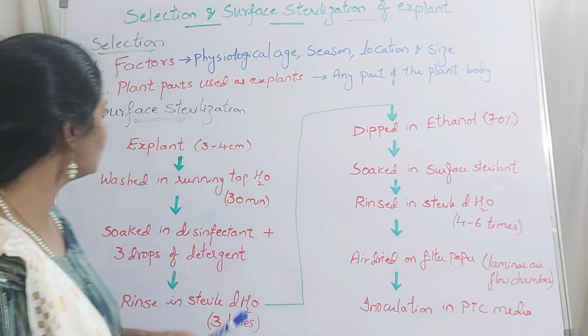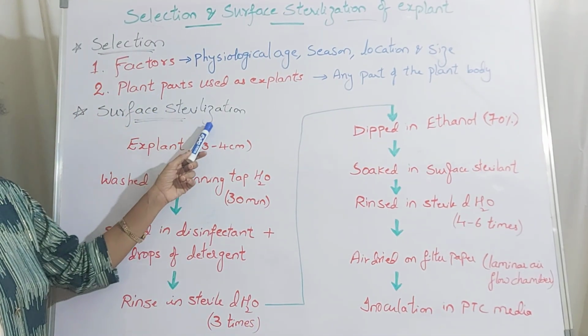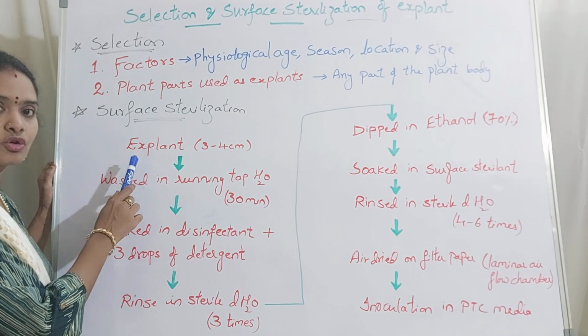Right, so for that purpose you are going to surface sterilize your explant. Right, so for surface sterilization, first you are going to decide which part of the plant you are going to take.